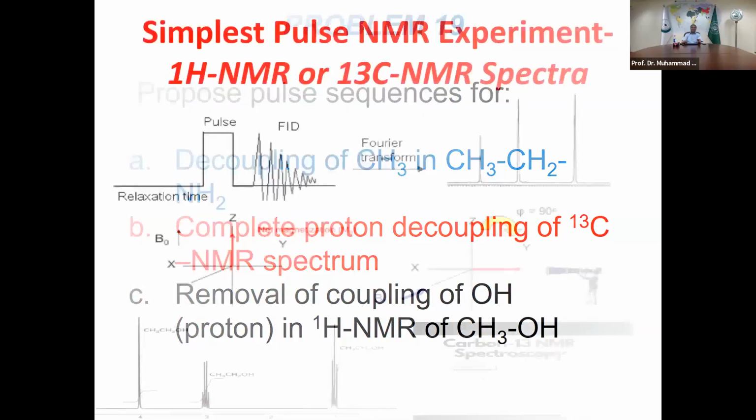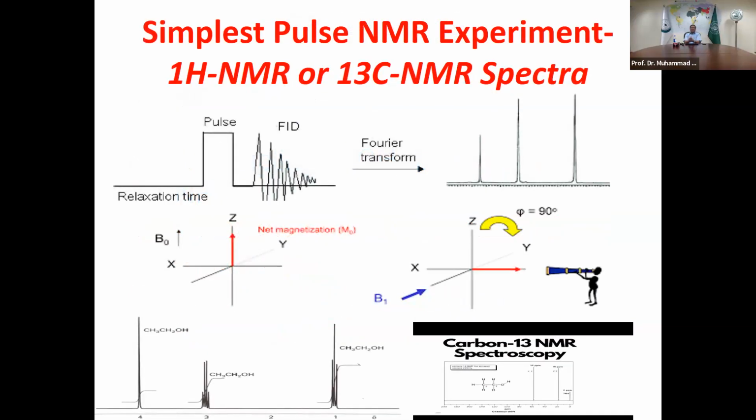Yes, sir. Okay, so let's discuss the simplest pulse NMR experiment. And that is something very exciting. The simplest pulse NMR experiment is represented in two different ways. On top of it, this one, can you see the arrow which I'm trying? Yes, sir, we can see that.